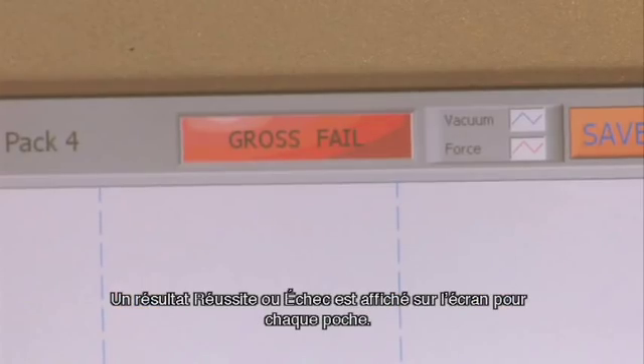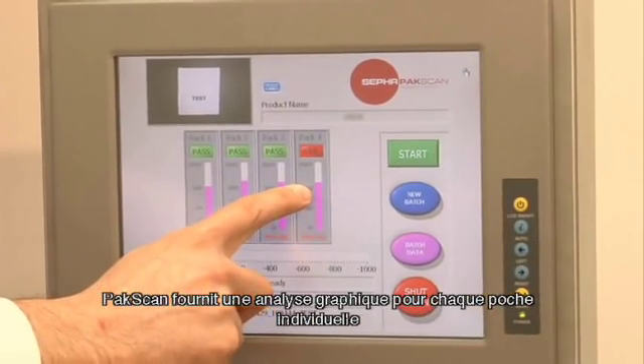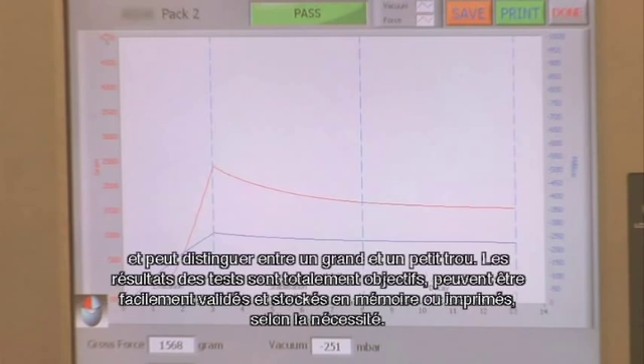A pass and fail result for each pack is shown on the screen. PackScan provides graphical analysis for each individual pack and can distinguish between a large and a small hole.